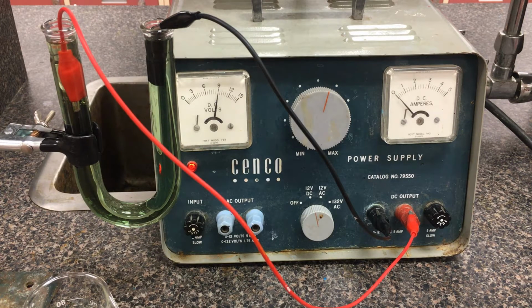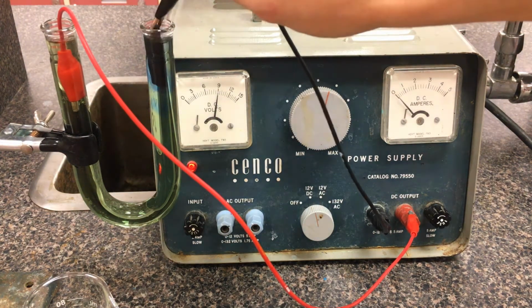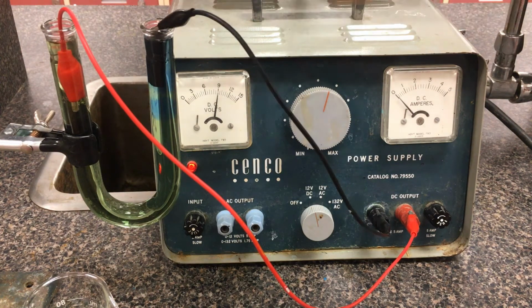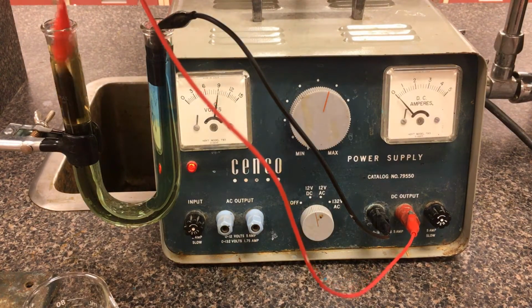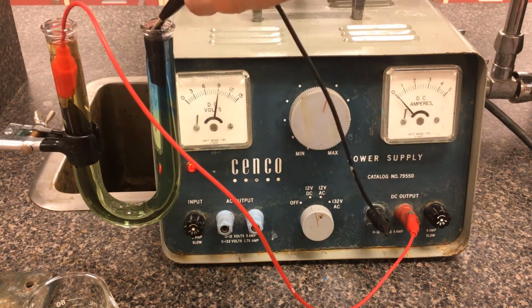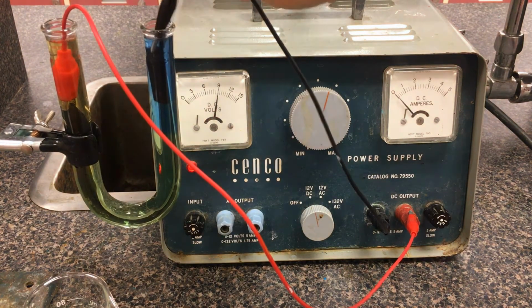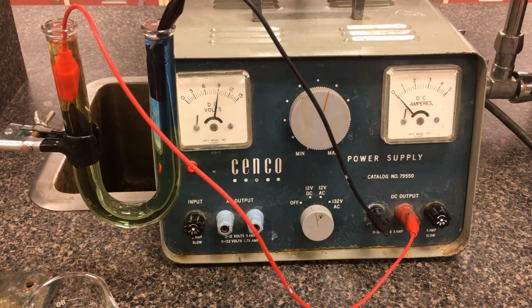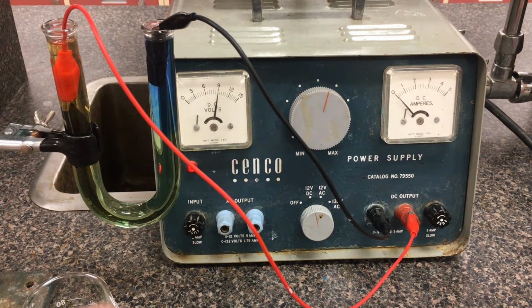We'll give it a little while for the reactions to occur. Sometimes it helps to just shake it so the ions that end up forming, you can see what happens to the bromothymol blue. Also shake that one there. There we go. With these physical observations, comparing against bromothymol blue as an indicator, you should be able to see the trace of the green that we began with. That was our control. This end has actually become a yellow solution, and this end has become a blue color solution.